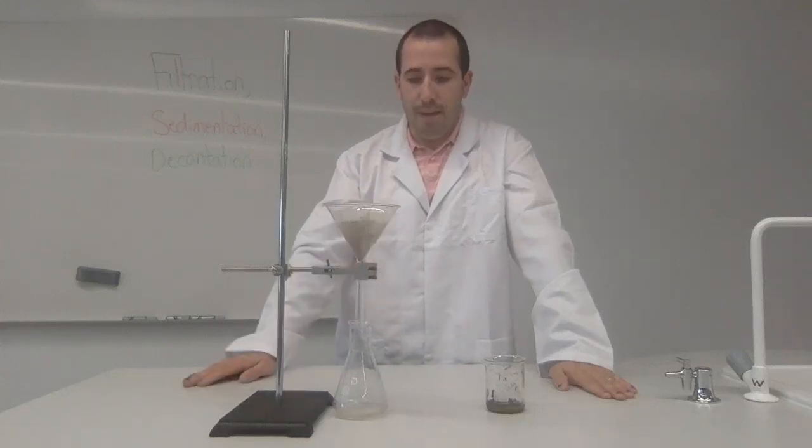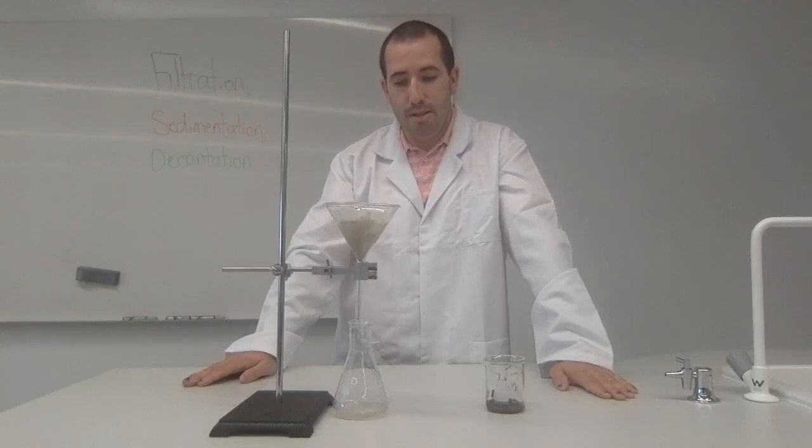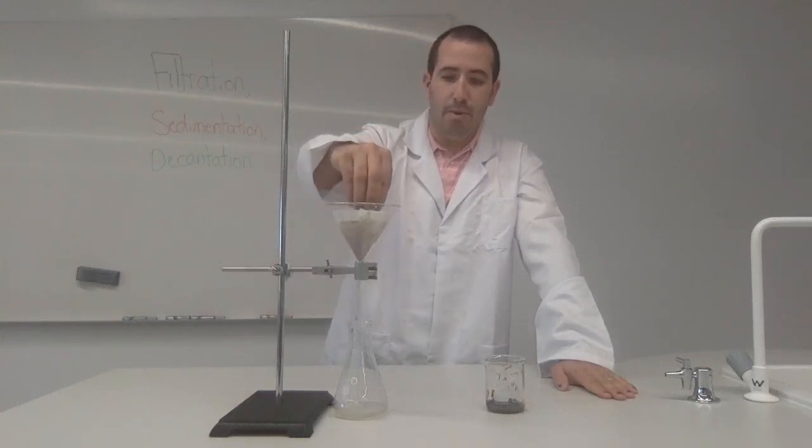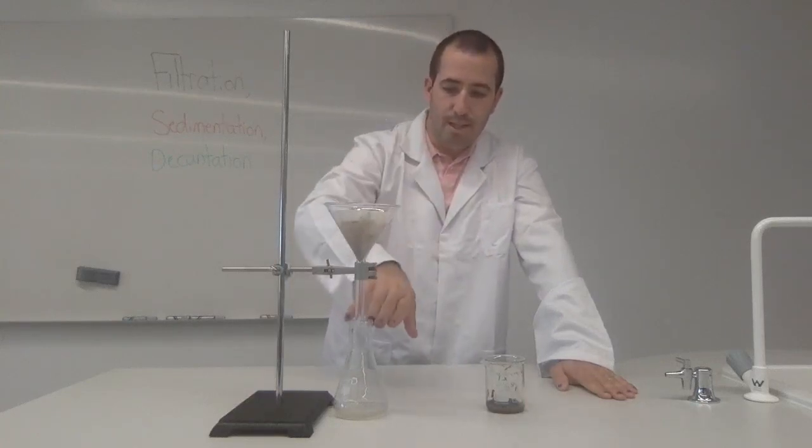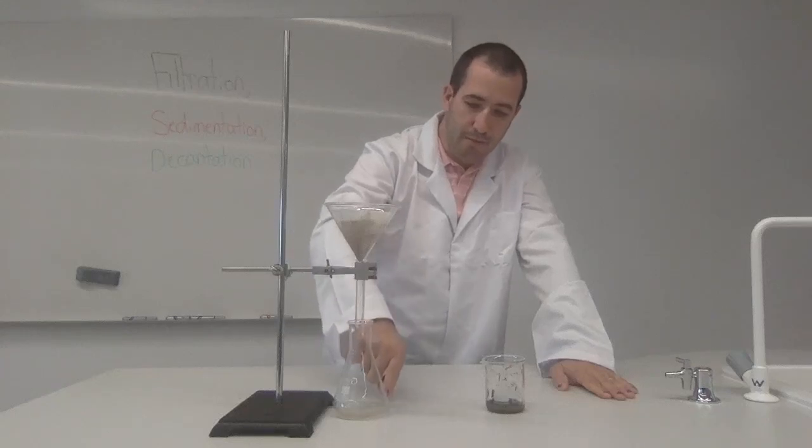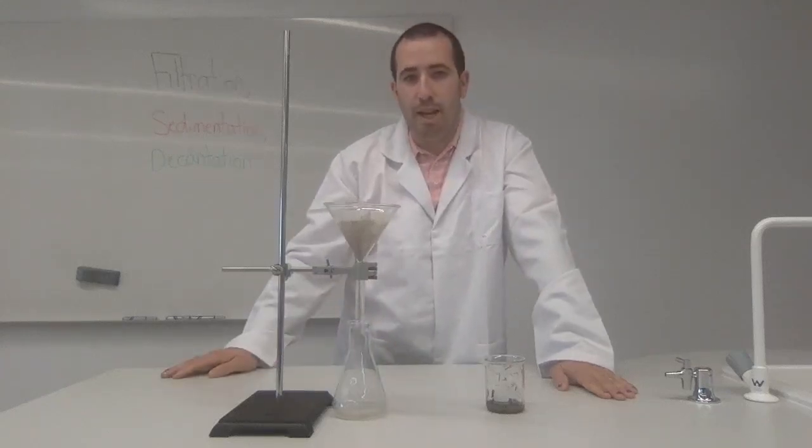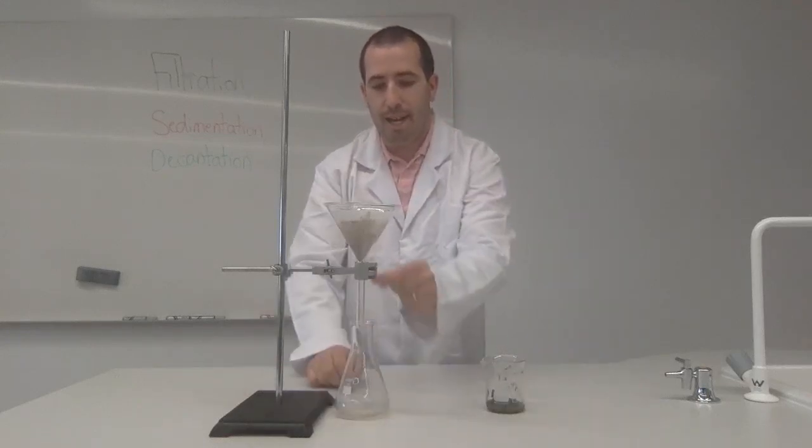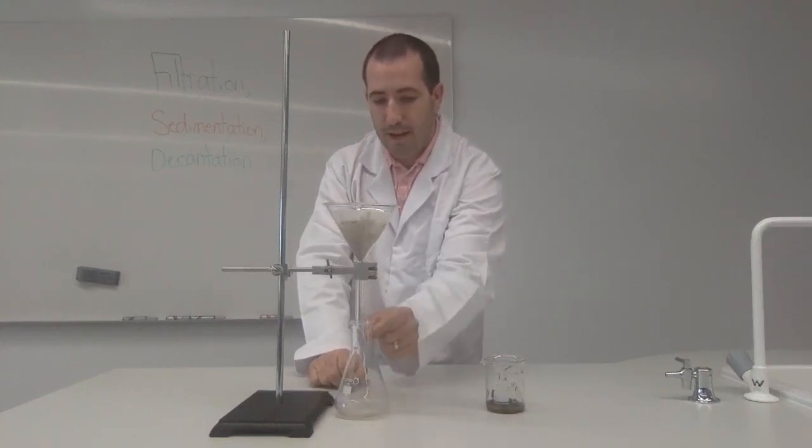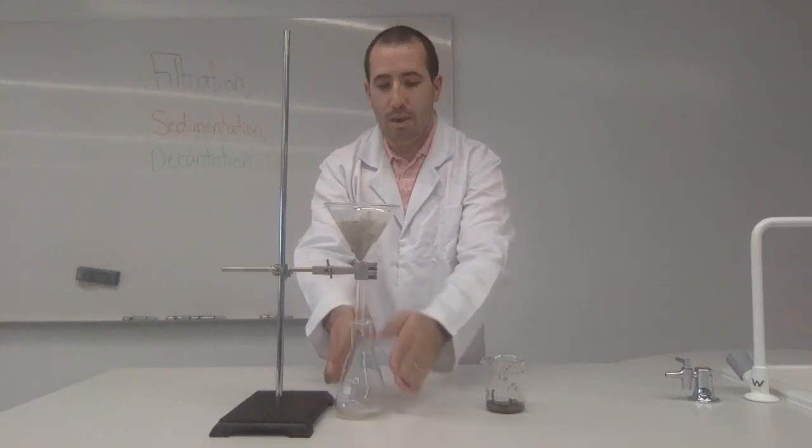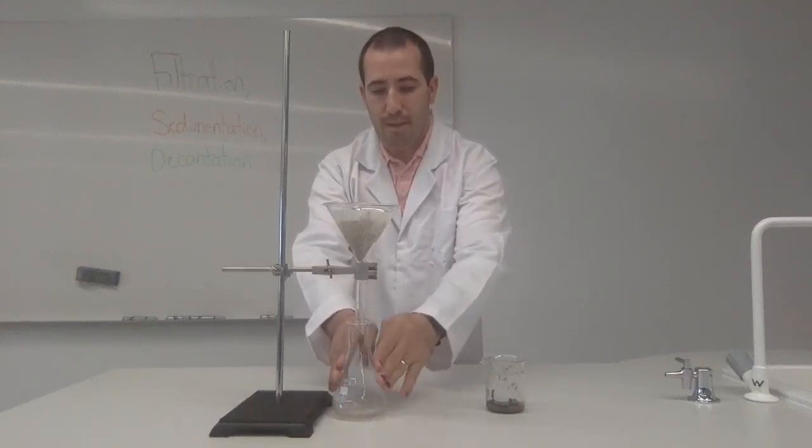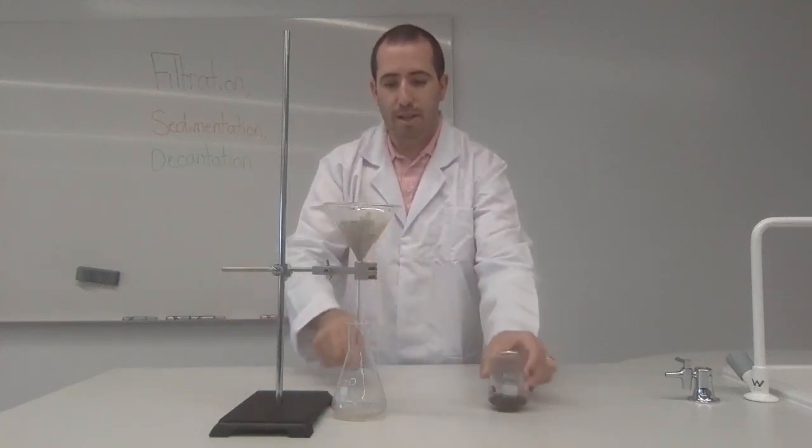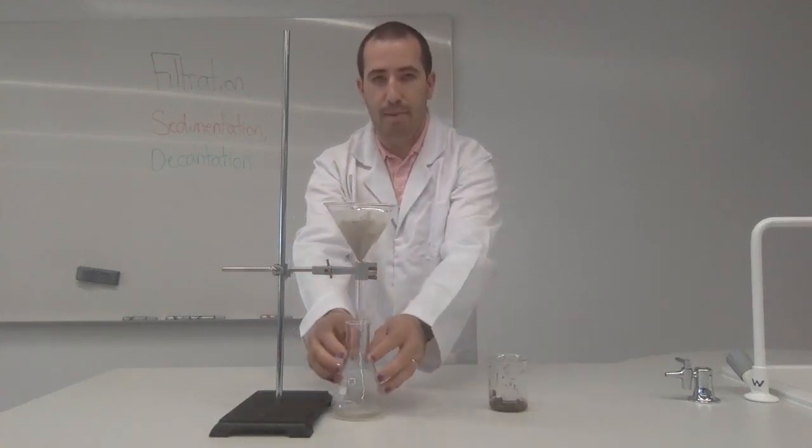So here we've got the process happening. And as you can see, it takes a very long time for it to happen, relatively long. And so then what we're left with is the liquid water passing through this, the funnel down the bottom, collecting into our conical flask. Now, why do we use a conical flask when filtering? Very simple. As you can see, it's got the edges here. So what happens as this comes down, it's obviously going to come down at a bit of speed and a bit of a splash. So what the conical part does, it traps some of the liquids from splashing out of a beaker, which would have a much wider rim. So therefore, everything that comes down is collected within the beaker.